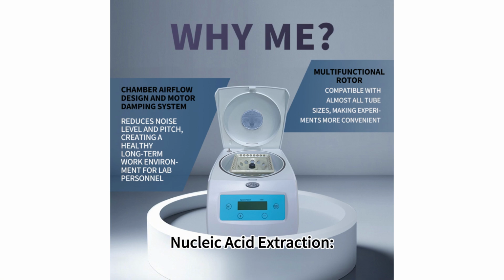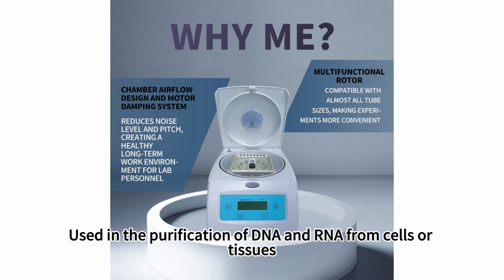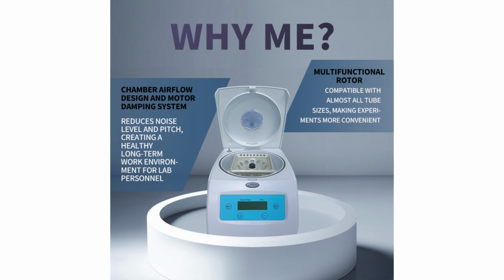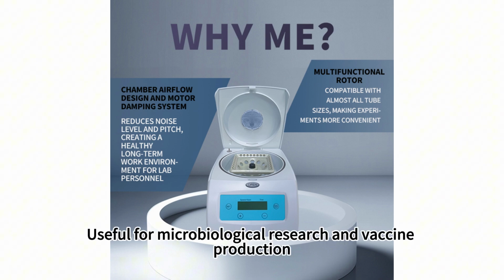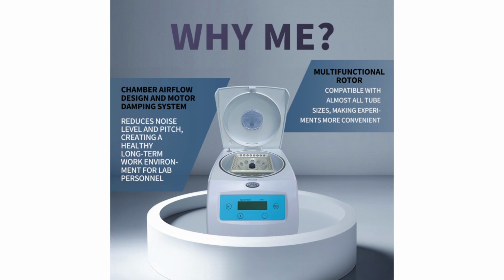Nucleic acid extraction. Description: used in the purification of DNA and RNA from cells or tissues. Importance: necessary for genetic testing, sequencing, and molecular cloning. Microbial pelleting. Description: enables the concentration of bacteria or viruses from large volumes. Importance: useful for microbiological research and vaccine production.